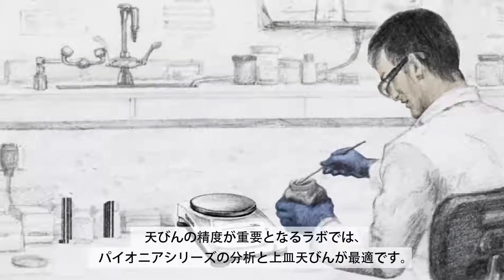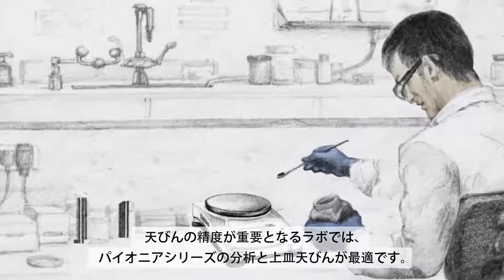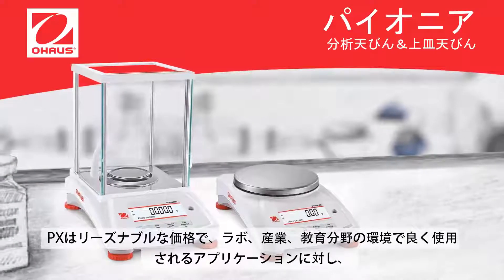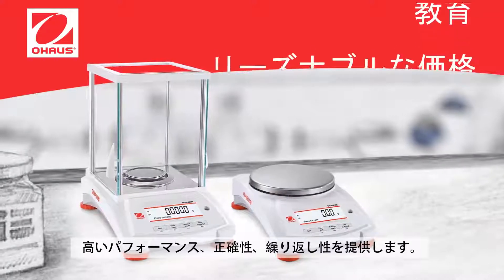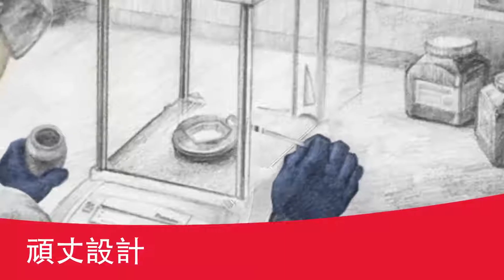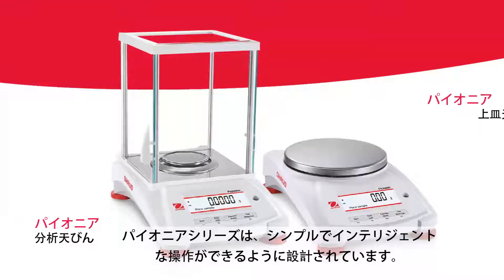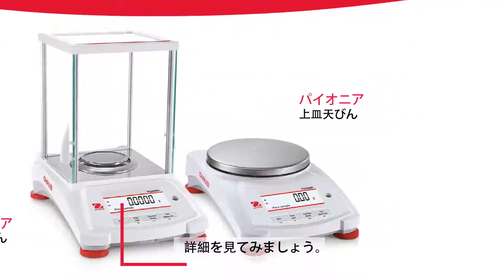In the lab, precision is key. Here's how the Pioneer PX series analytical and precision balances measure up. The PX offers high performance accuracy and repeatability for essential weighing applications in laboratory, industrial, and education settings at an economical price. It's also durably constructed to last, so your investment in this equipment is long-term. The PX series is designed for simple, intelligent operation in a variety of professional settings. Let's take a closer look.